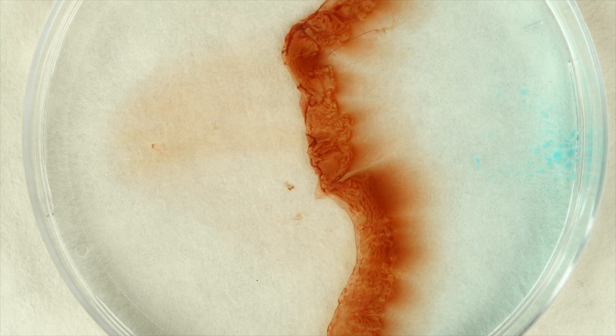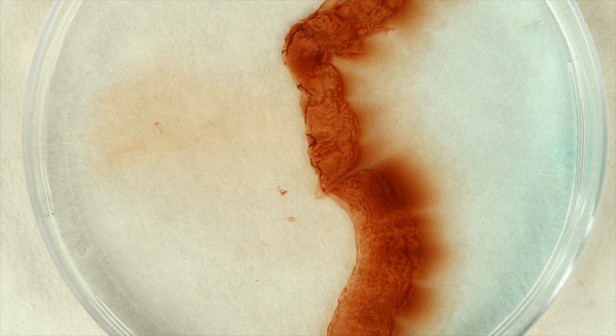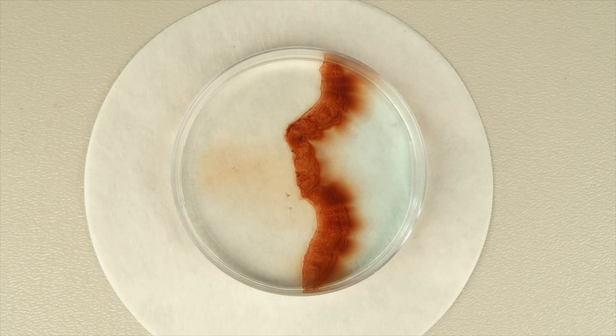Both copper sulfate crystals and potassium hexacyanopherate 2 crystals dissolve easily in water. When they meet in the center of the petri dish, the dissolved substances react with each other to form an insoluble compound, making the miraculous chemical reef.